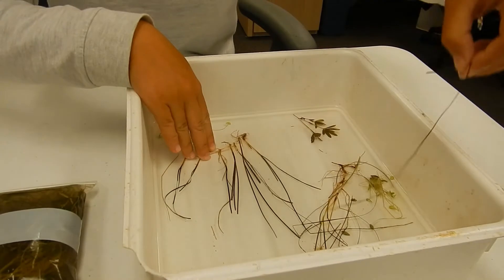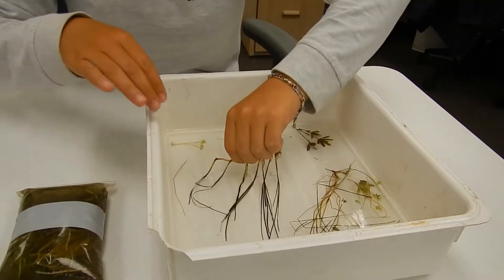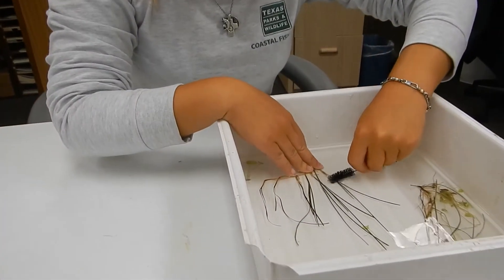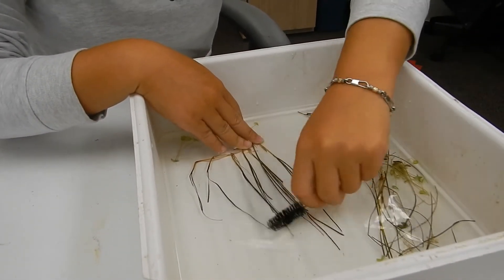First I'm going to clear it out and make sure there's no extra pieces on here. I'm going to show you how we clean the sample — we're going to brush it over the leaves and everything to remove the algae and sand that might still be stuck on there.